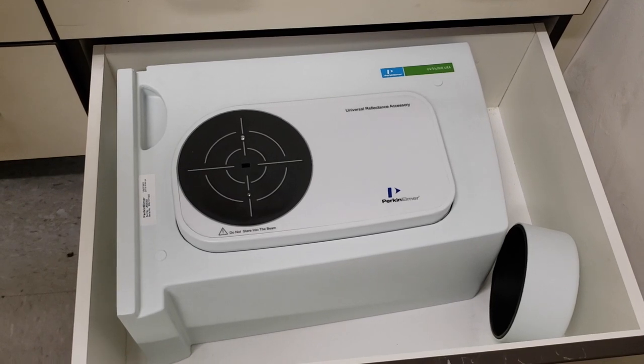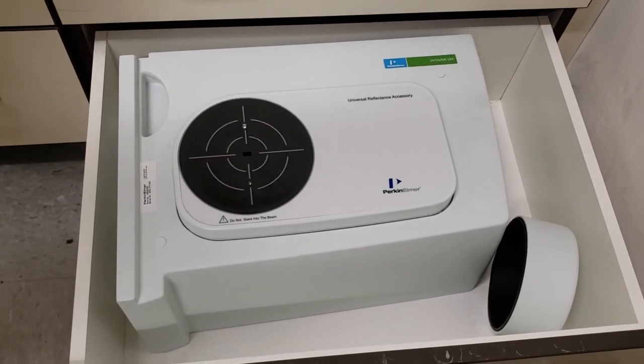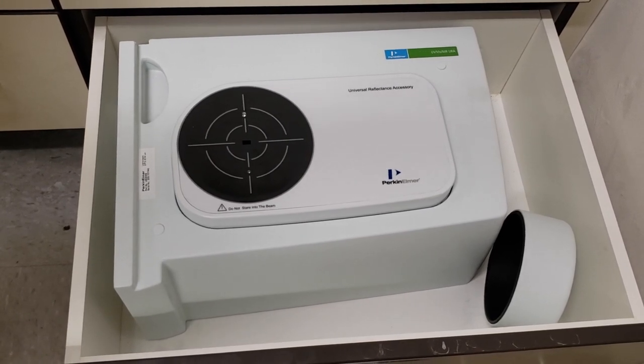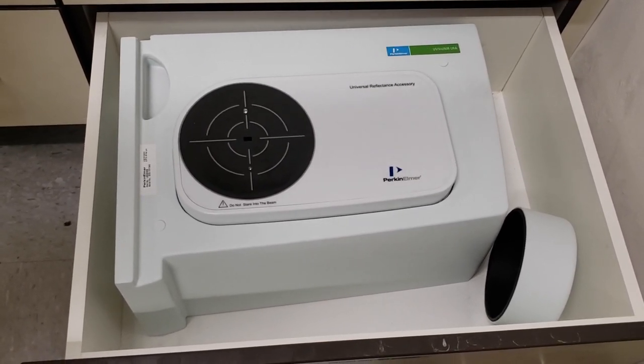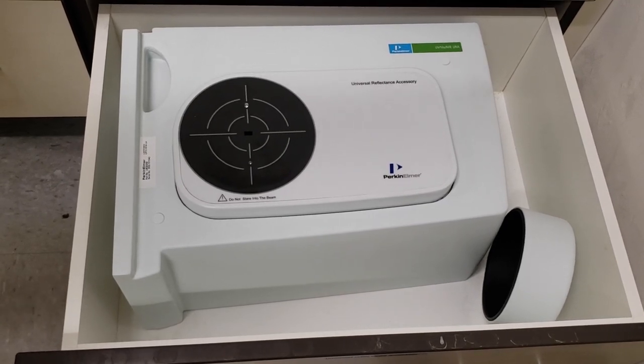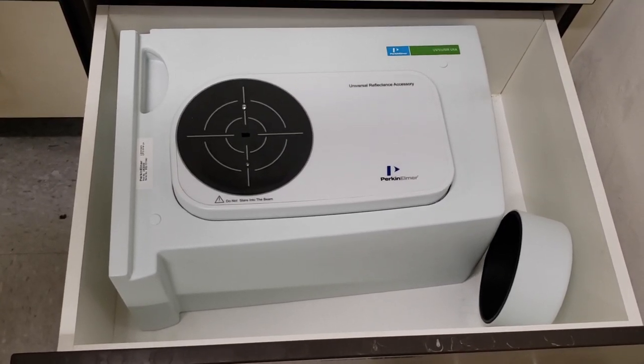The URA in the software does have a couple of extra options, which I will show you. As far as sample loading and prep, it's fairly easy. It is mainly used for solids, but you could use a liquid or a powder as long as you prep it properly.